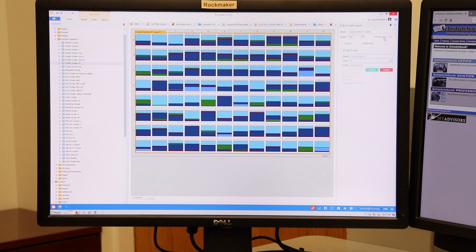If you look over here, this is your volume of the well. So 50 microliters is the standard. If that's different, you can adjust it. And when you update it, the recipes should change accordingly. So next step is you want to get your protein into the drops here.